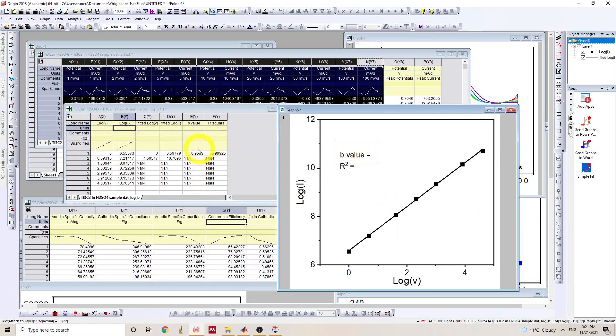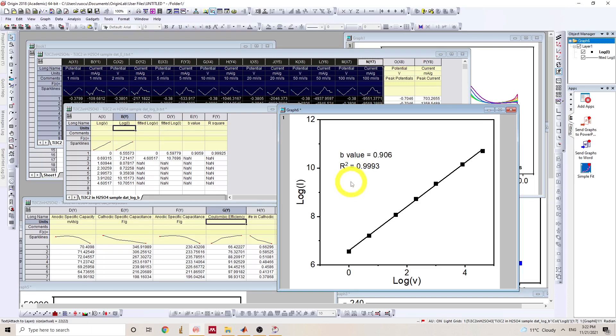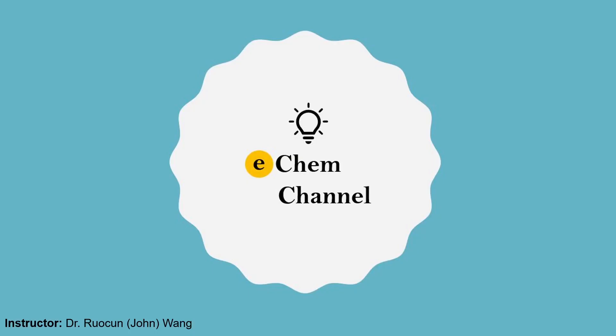We read from this cell, that's 0.906, depending on how many significant numbers you want to save. And the R squared is 0.9993, also depending on the number of significant values you want to save. Yeah, that's about it.